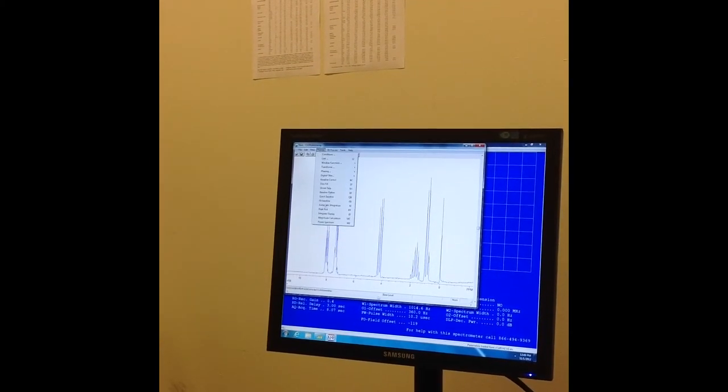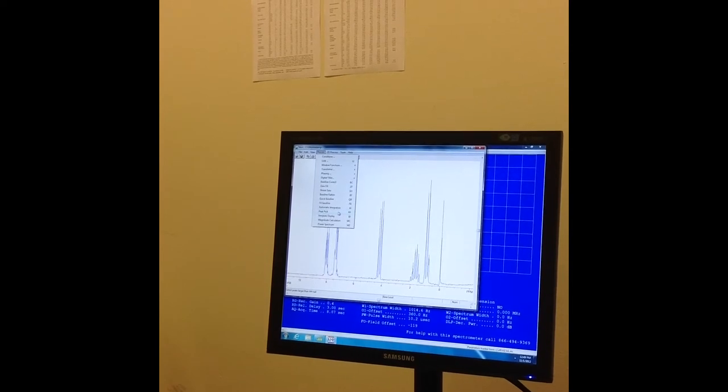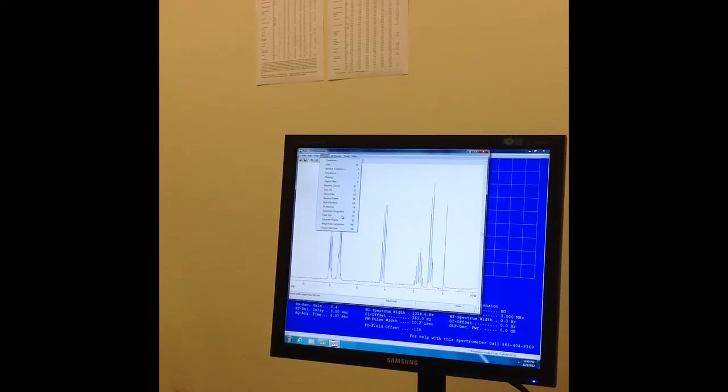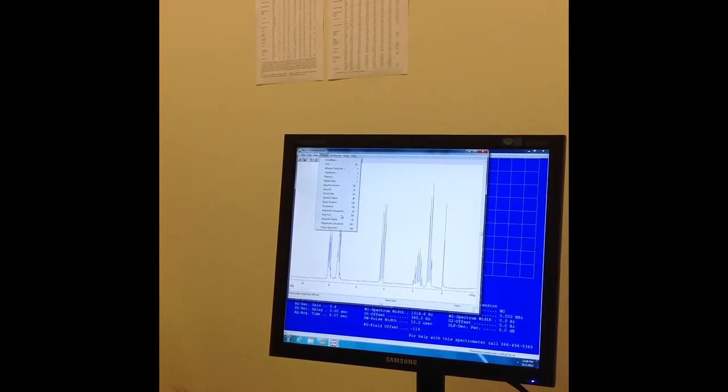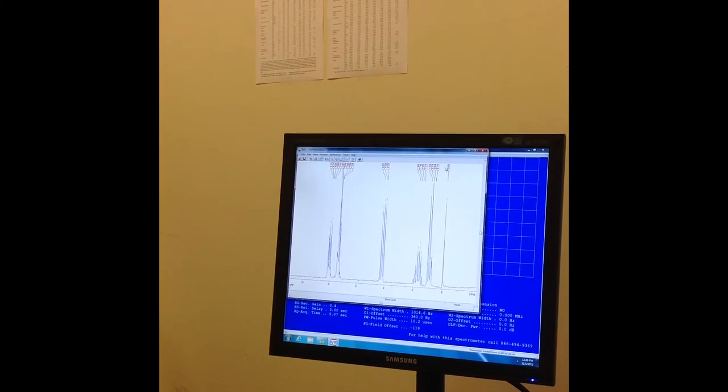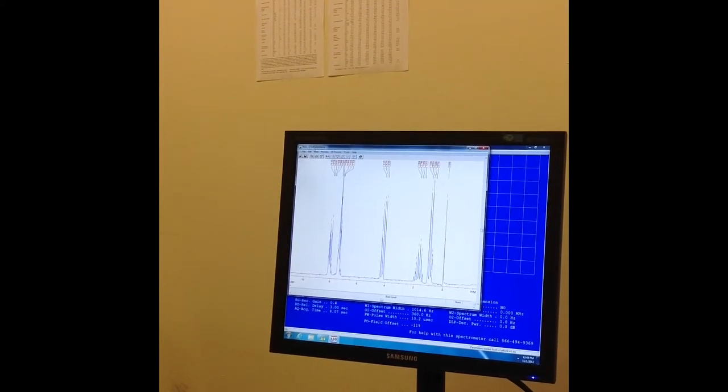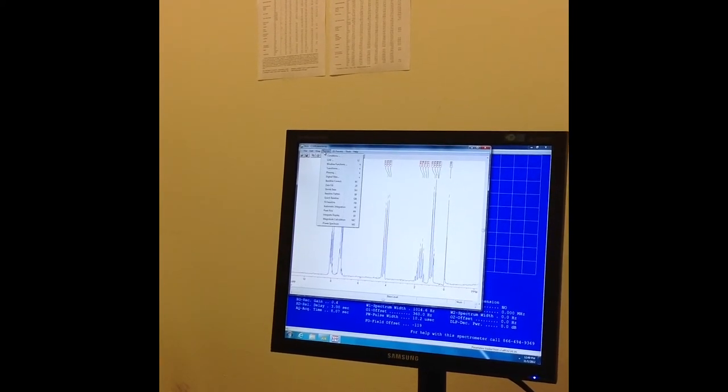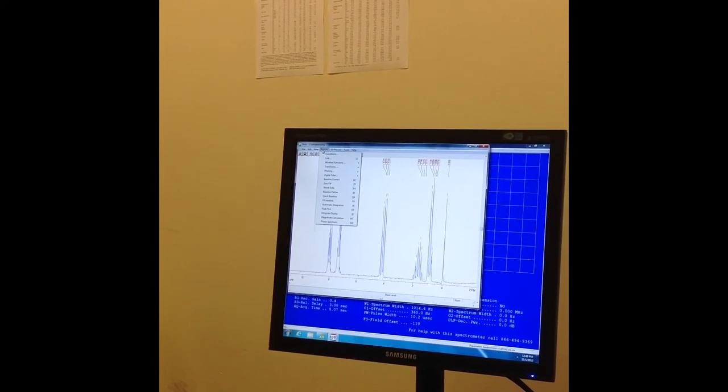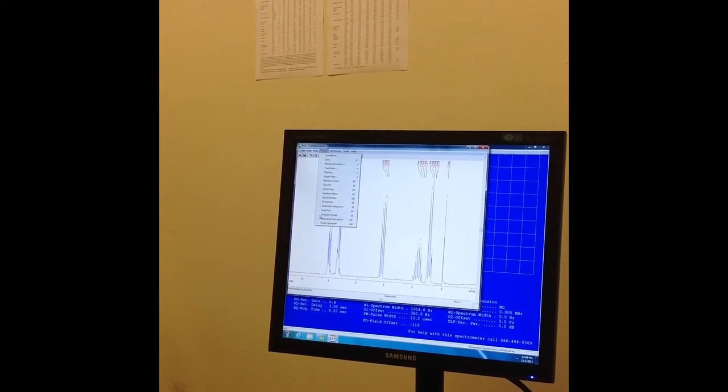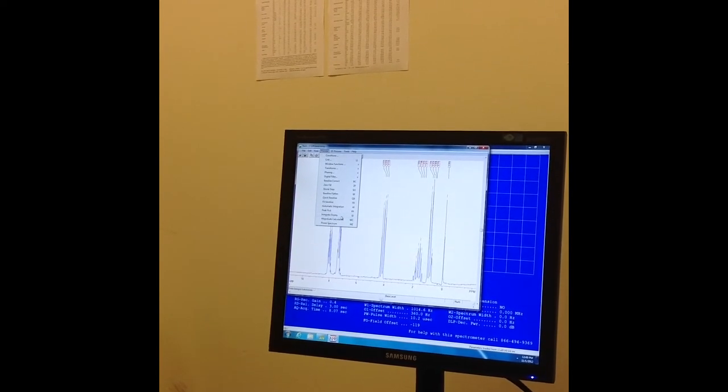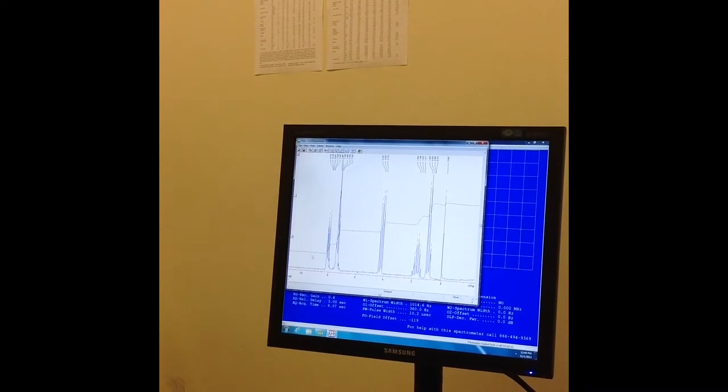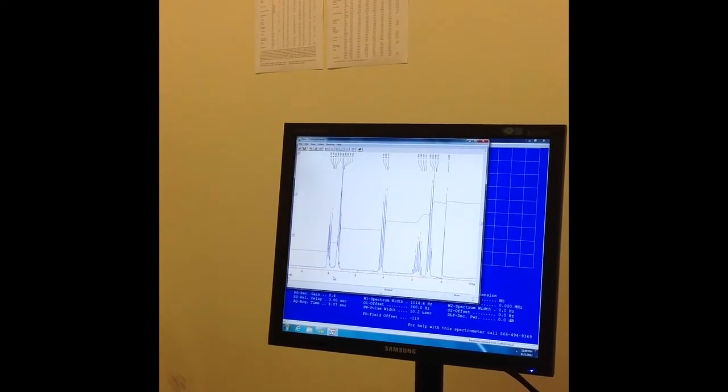Now I'm ready to do Peak Picking, and that's PP, so I'm going to click on that all under the Process tab, and that shows these values right up here. Then I can go under Process again, and now I'm ready to Integrate. That's Integrate Display, I'm going to click on that, and you'll get this kind of gross thing here.